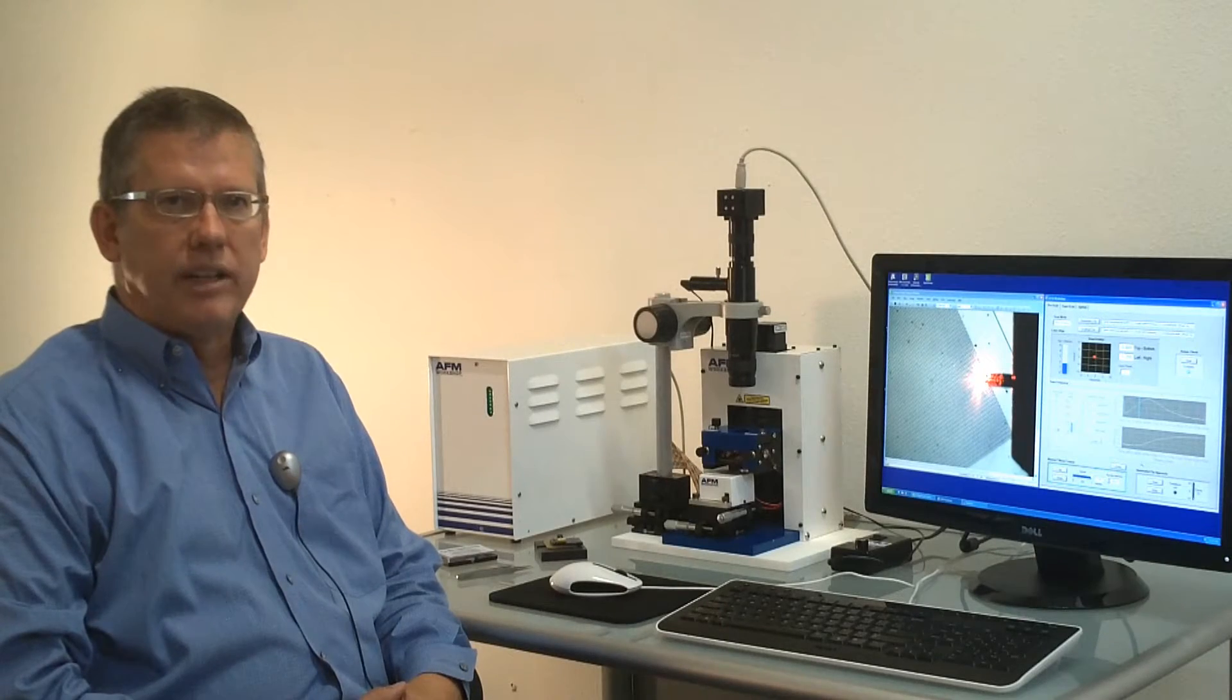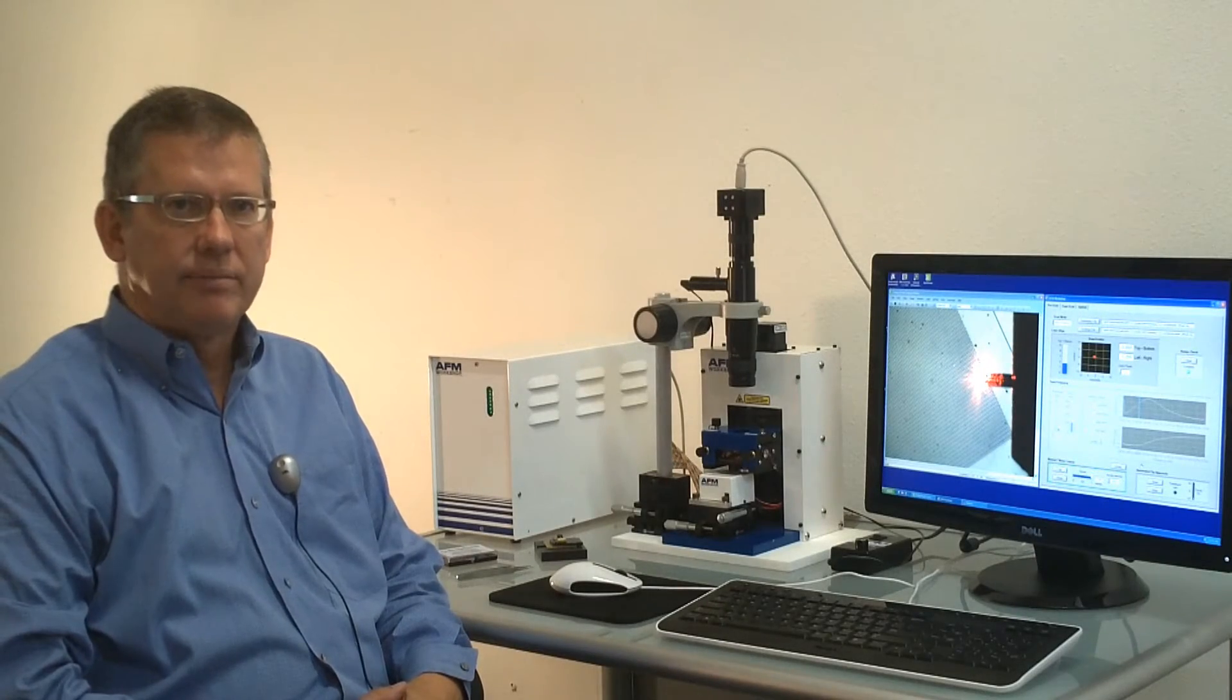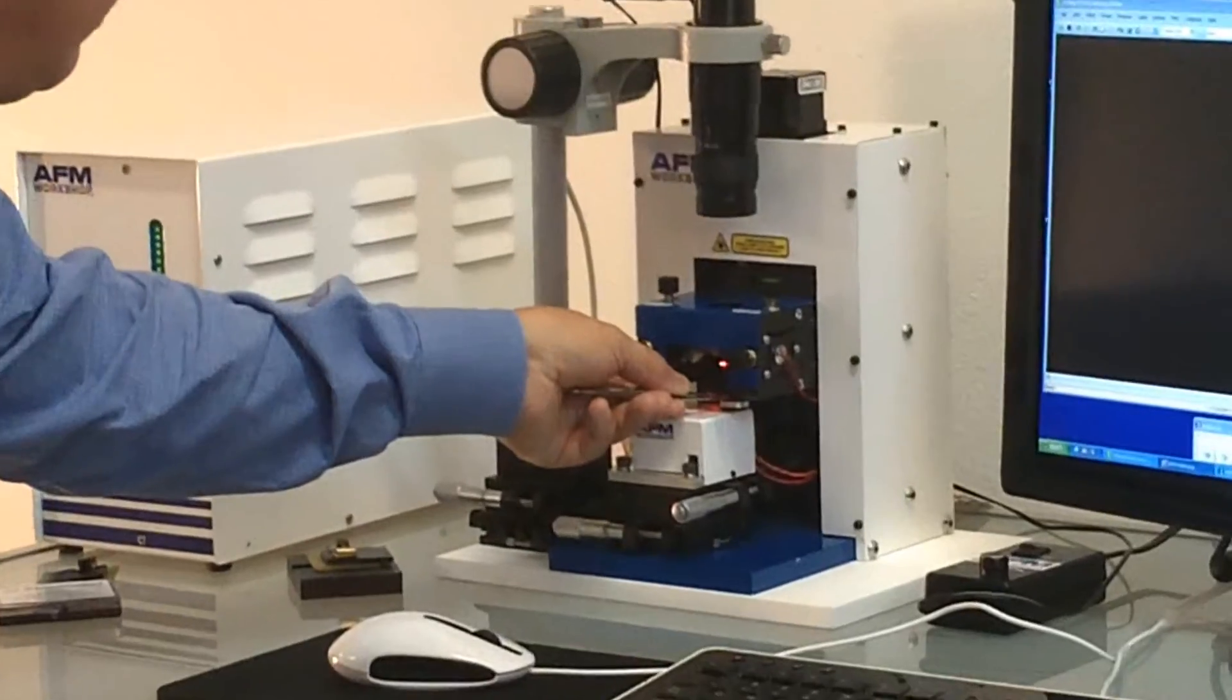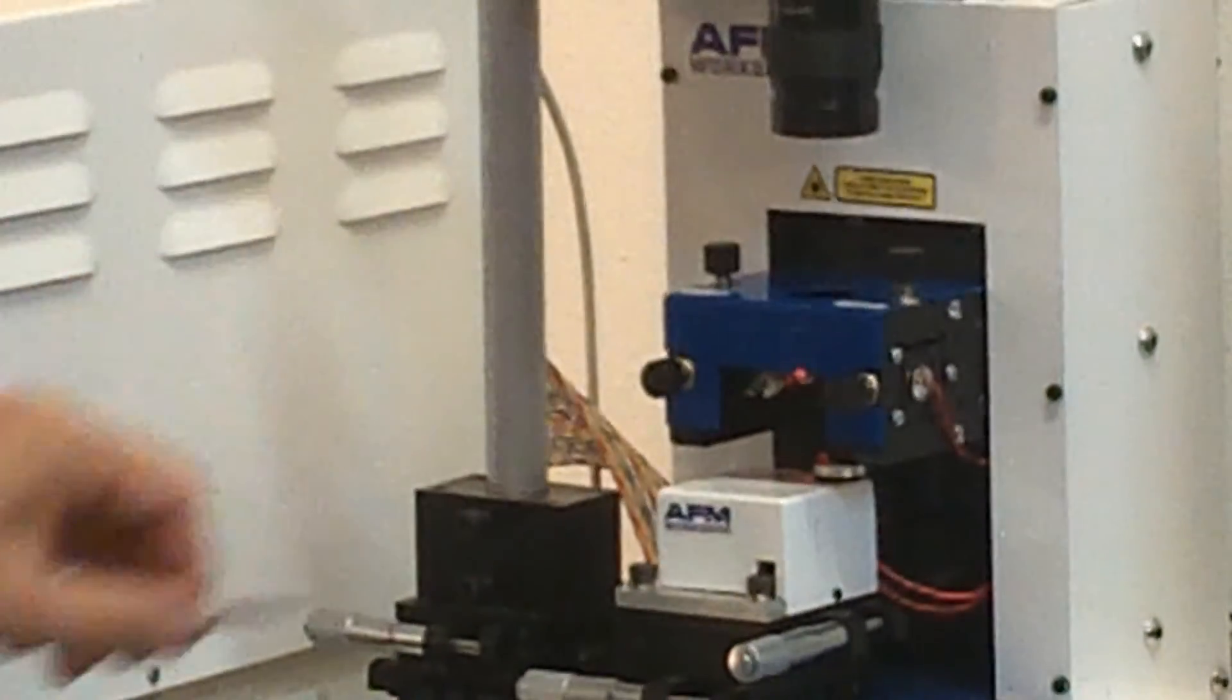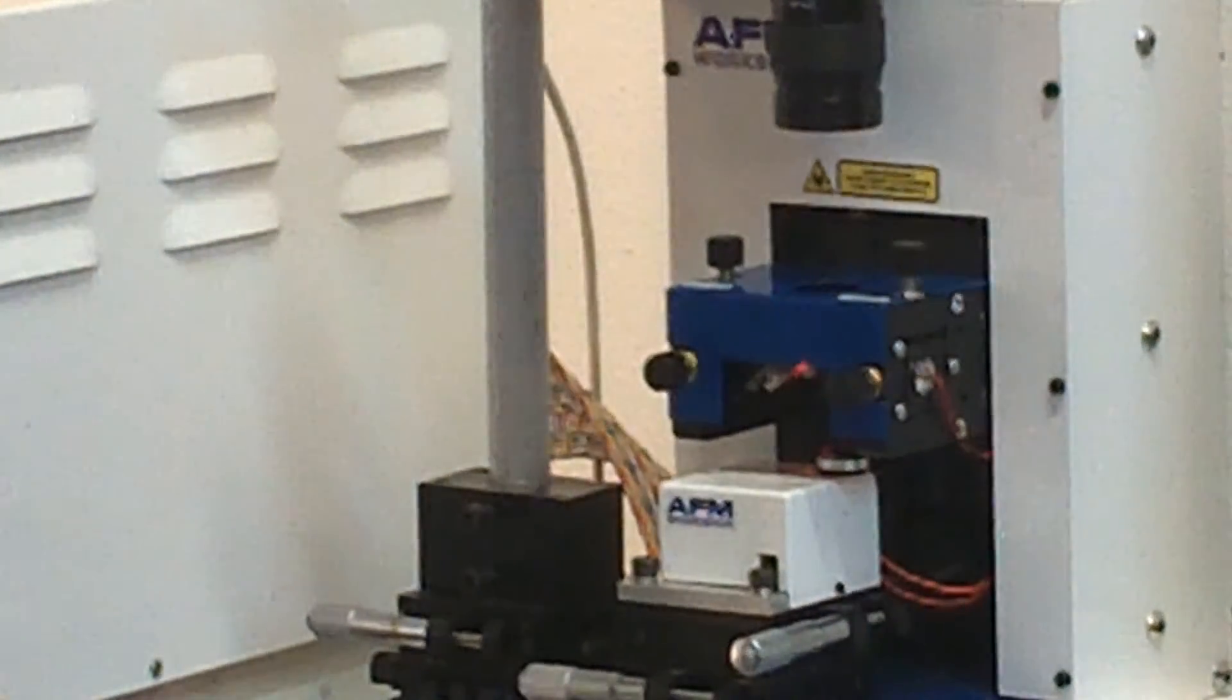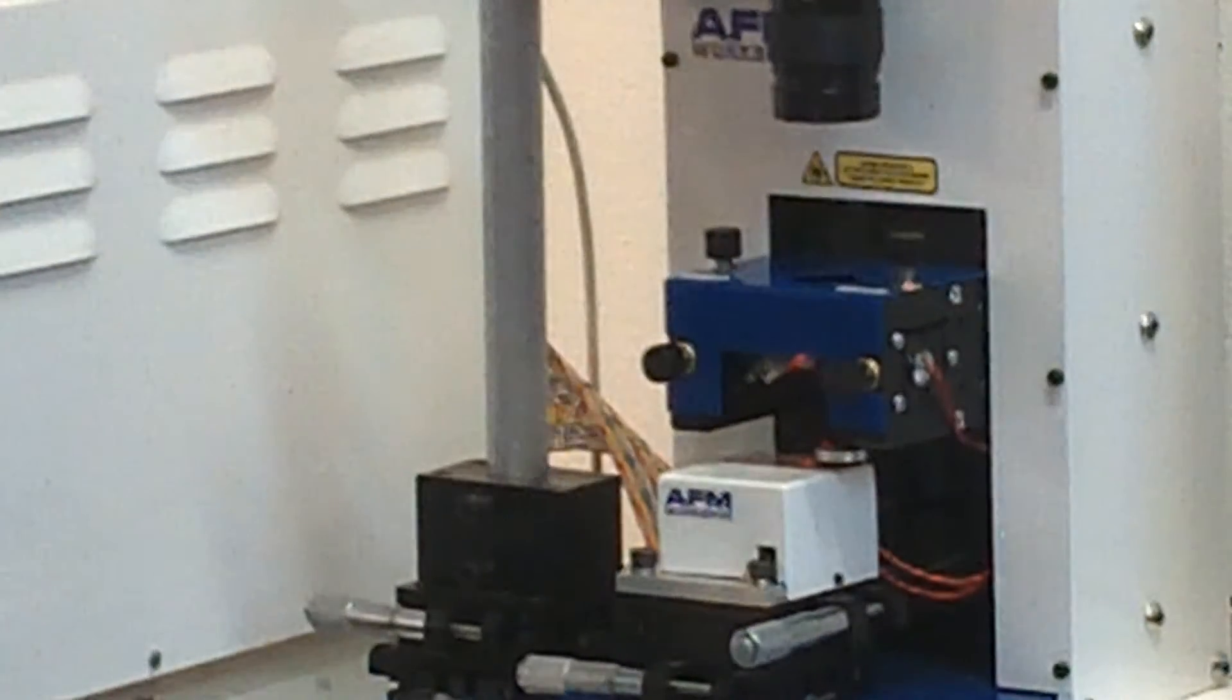I'm now going to demonstrate the operation of the TTA-FM. The first step is to introduce a sample into the microscope stage on the top of the piezoelectric scanner. This is done with a pair of tweezers.